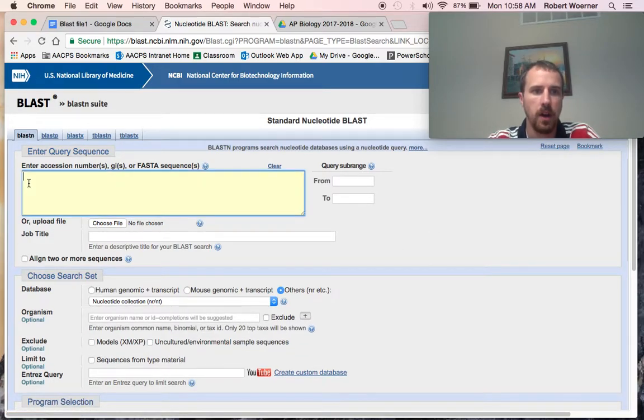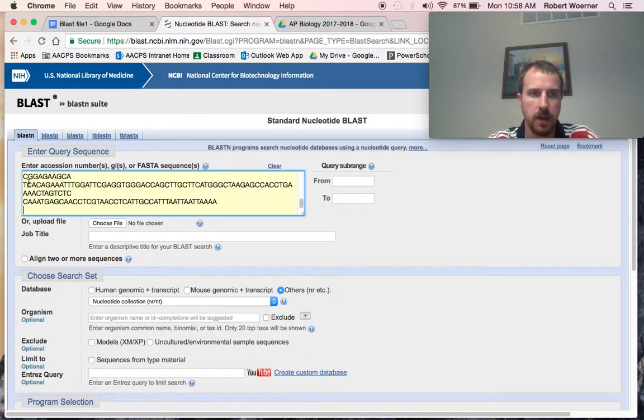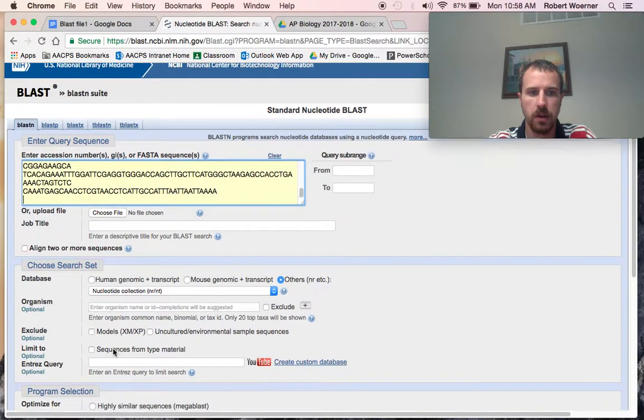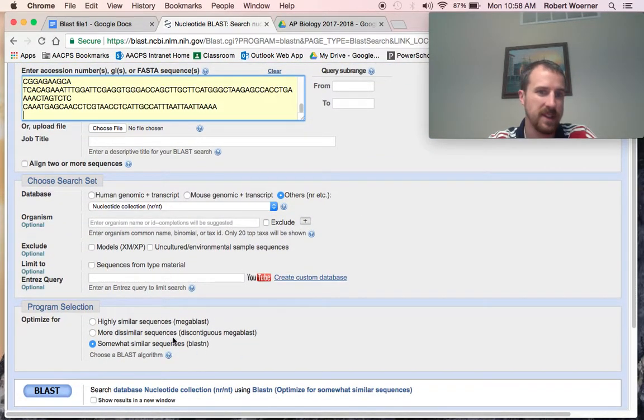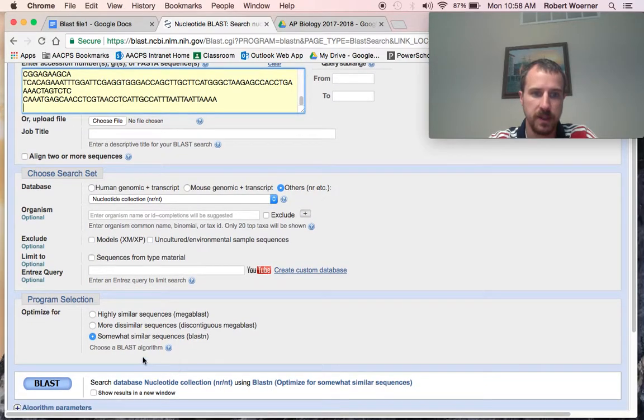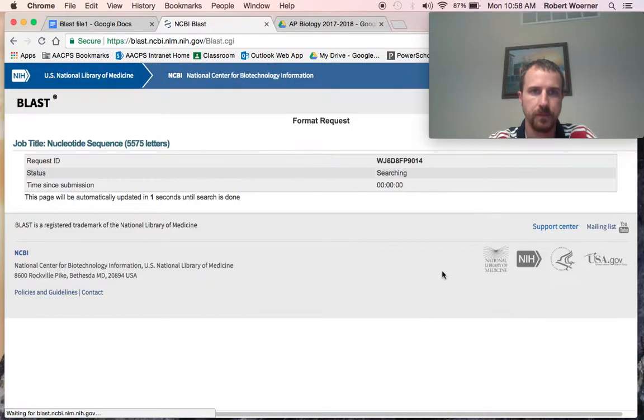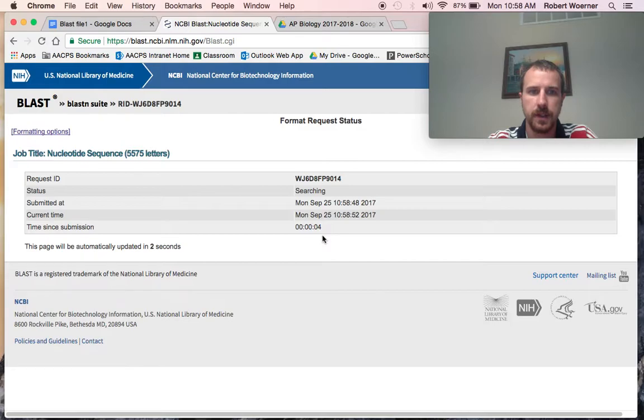All we have to do is put it right into here. Do not mess with any of this stuff down here. This is all programming stuff that would mess up our data. All we need to do is click the BLAST right there. We clicked our BLAST.